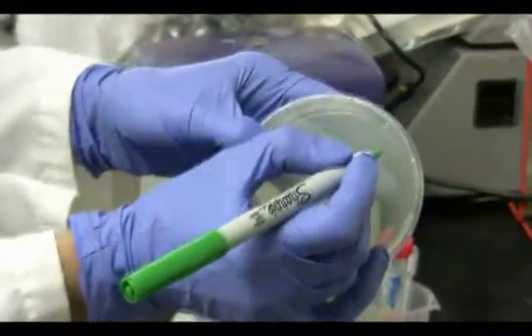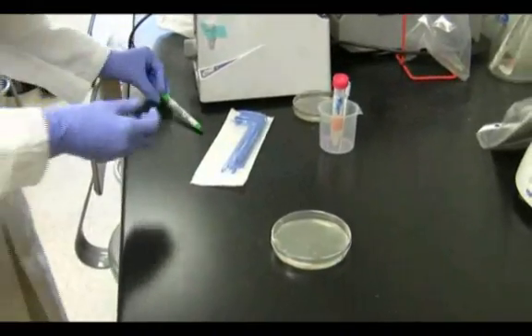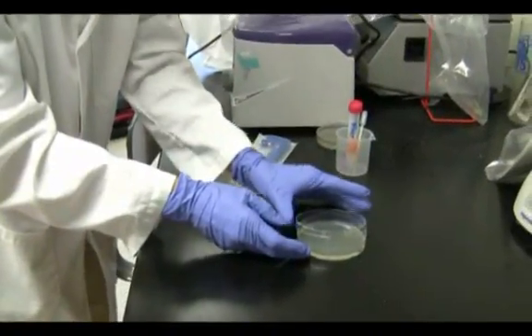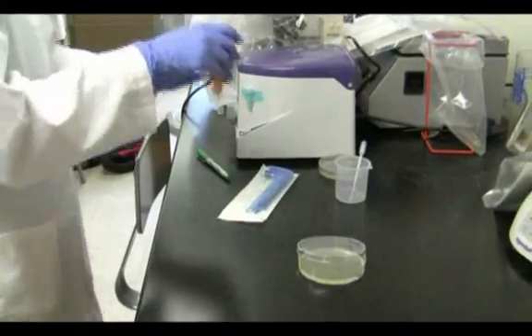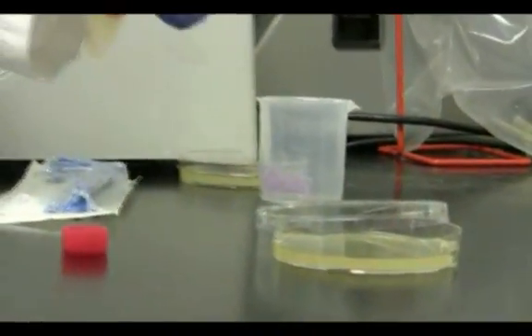Label the plate on the bottom edge. To inoculate the plate, open the plate up just a little bit. From an overnight culture of E. coli, remove 100 microliters and dispense onto the plate.